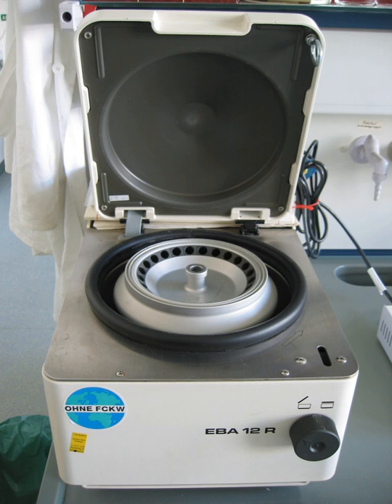Differential centrifugation, often used to separate certain organelles from whole cells for further analysis of specific parts of cells. Isopycnic centrifugation, often used to isolate nucleic acids such as DNA. Sucrose gradient centrifugation, often used to purify enveloped viruses and ribosomes, and also to separate cell organelles from crude cellular extracts. There are different types of laboratory centrifuges.